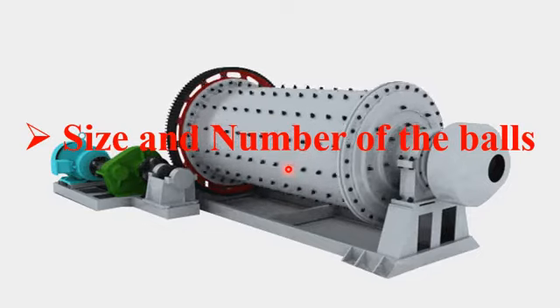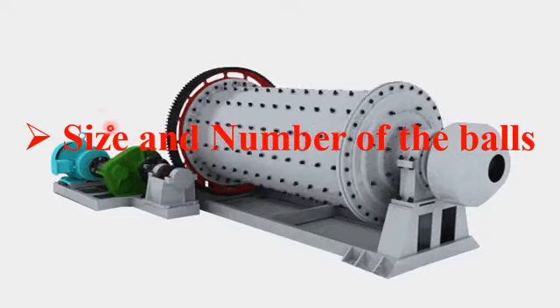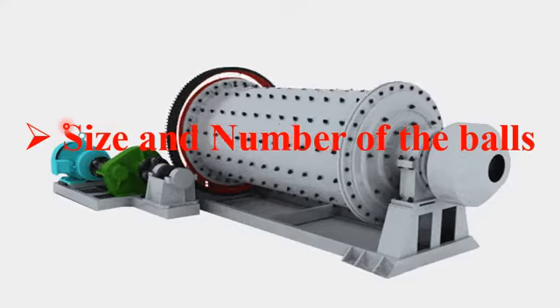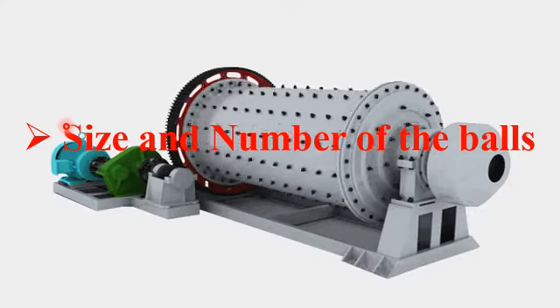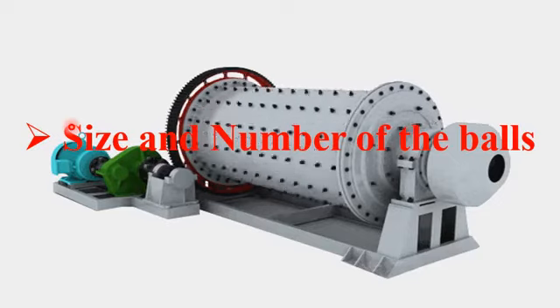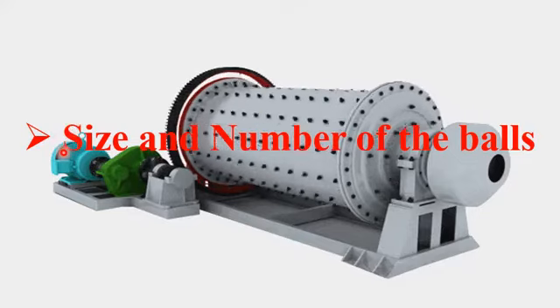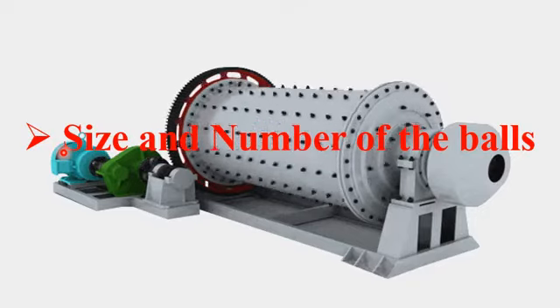Usually different sizes of balls are used. Number one, balls with larger sizes. Whereas the second type of balls used in the ball milling process are the smaller balls. Medium sized balls are also used in the ball milling process.